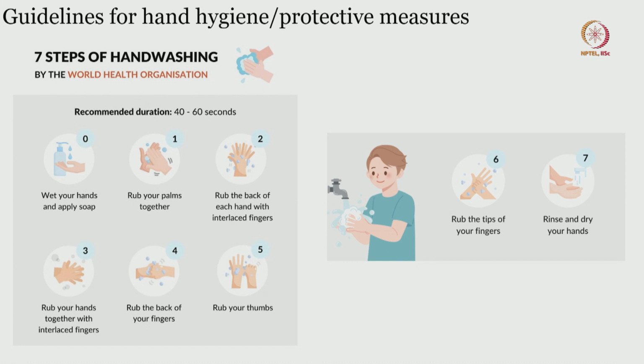Ideally a good manicure needs to be done, and if that is done, then the tip of the finger needs to be rubbed in the center of your palm to ensure that the nail bed is taken care of. And finally you rinse and dry your hands.